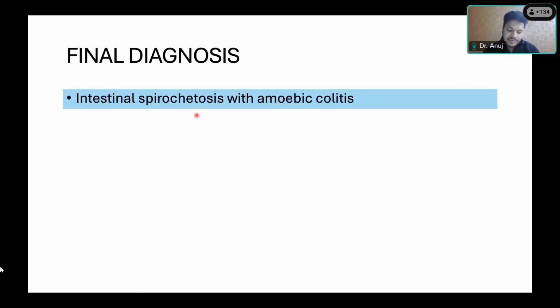Genta, ma'am, Diff-Quik, Giemsa, Alcian yellow. We use a modified Giemsa stain. Okay, so a modified Giemsa stain is used. That is a 2% modification of Giemsa, not the Giemsa that we use in the hematology lab. Same stain, but prepared in a modified manner.